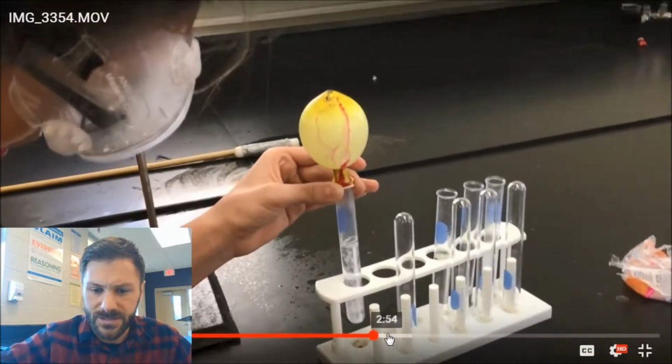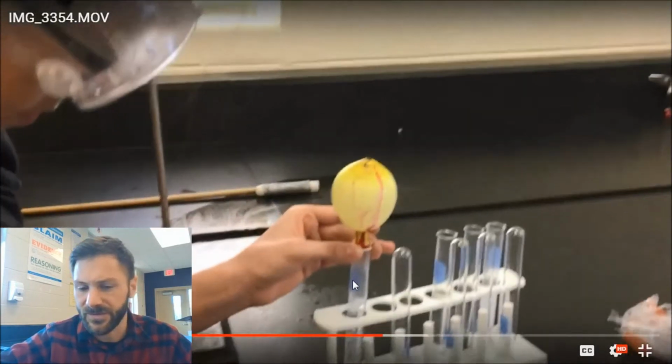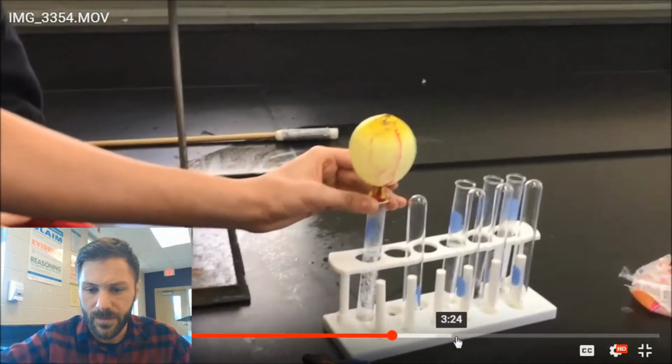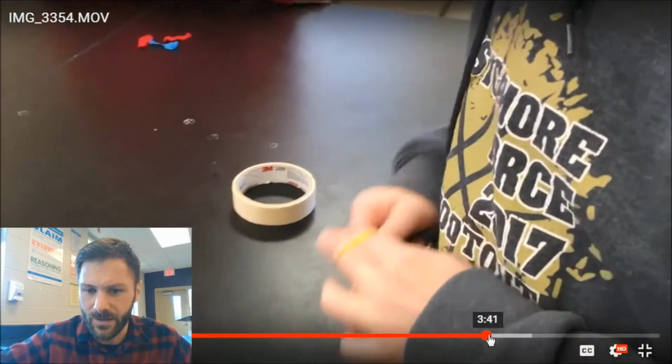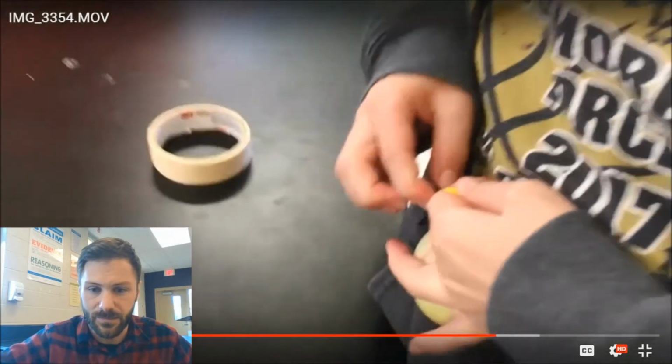Okay. And what you'll notice here is the zinc is nearly gone. The bubbling has become less severe, less intense, and now the zinc is almost gone. So fast forward a little bit more. What they're trying to do here is they removed the balloon and they're going to tie it off. So now we've captured whatever gas that is inside the balloon.